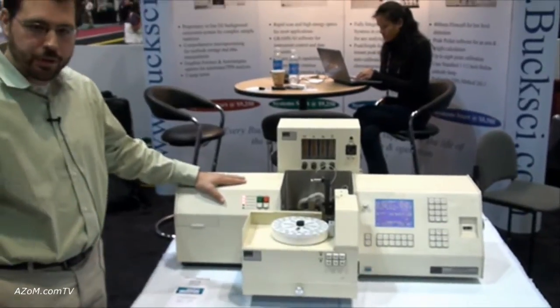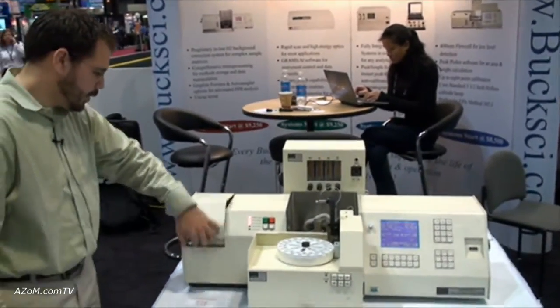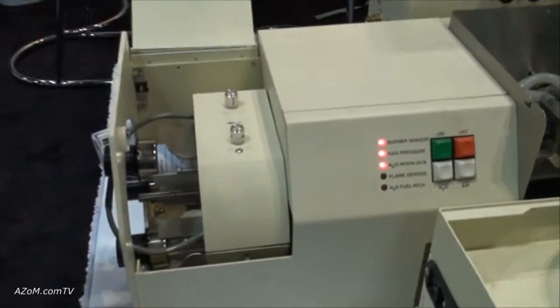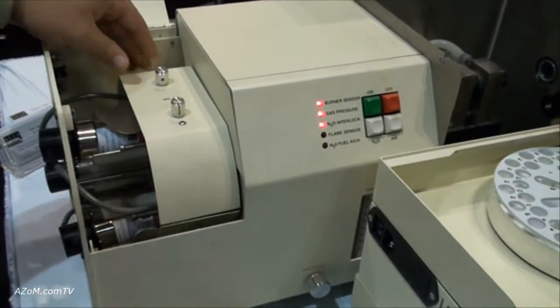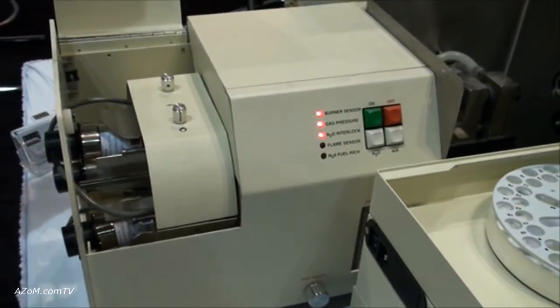It's based on our 210 or 211 system, which has a three-lamp turret. There's one active hollow cathode lamp on top, and you can manually switch to a different lamp that's already warmed up, which eases metal transitions.